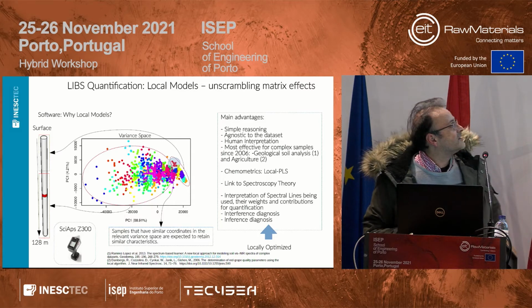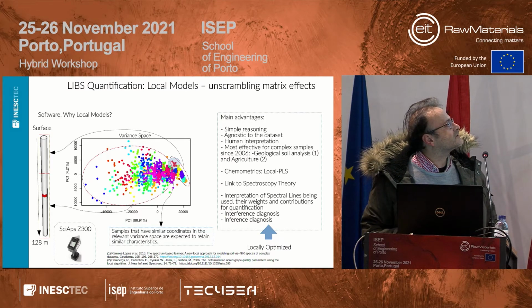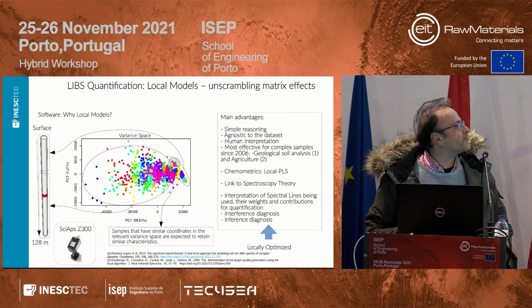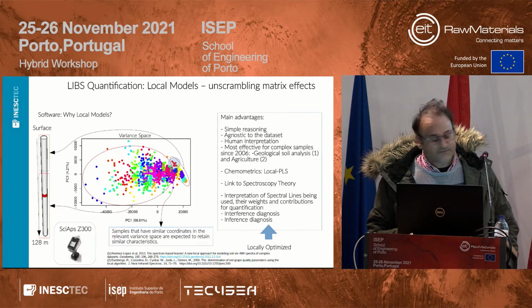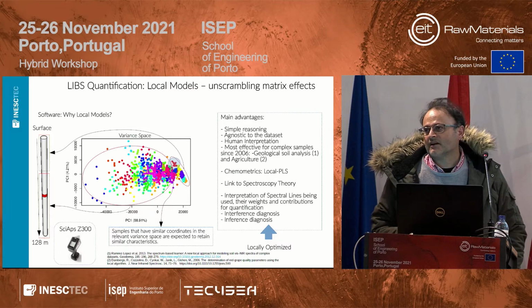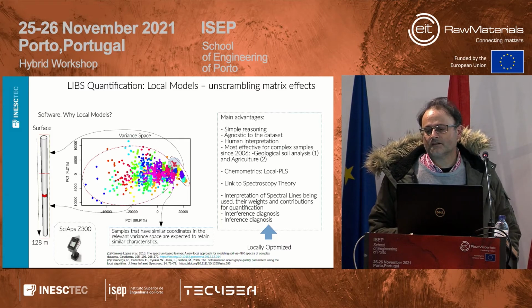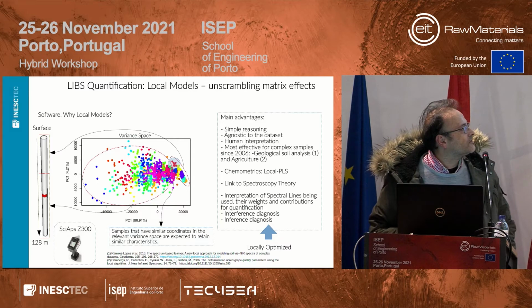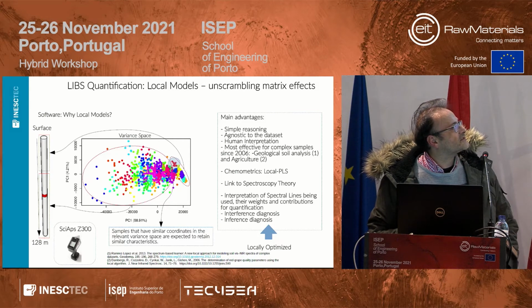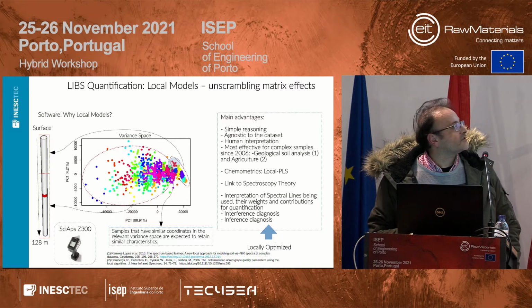So in this sense, we are developing our models, which are local models. What do we mean by local models? We mean that within samples that have different characteristics and different types of LIBS characteristic spectra that will cluster together, will have properties that can be used within these clusters to quantify the elements that we need to quantify. So in this case, these methods are agnostic to the data set and allow human interpretation because we can understand what lines are being used for the quantification.